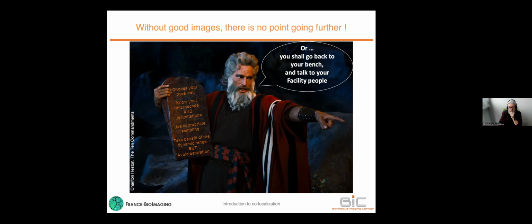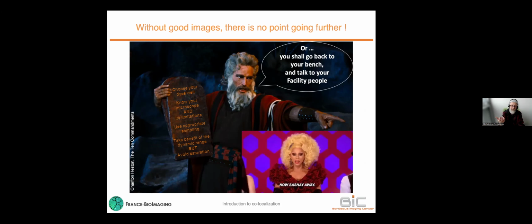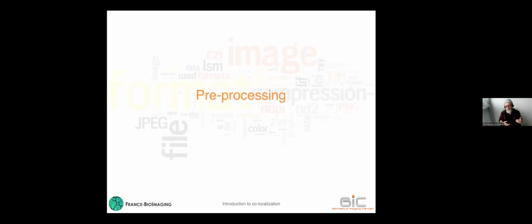Generally speaking, when on the facility I don't get the quality check done, if the images are not good, well, as Mamaru would say, I'm asking my users to sashay away, and I will check with them and make sure that they've got pretty good data before resuming the analysis.